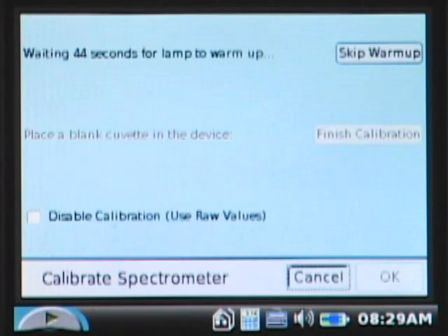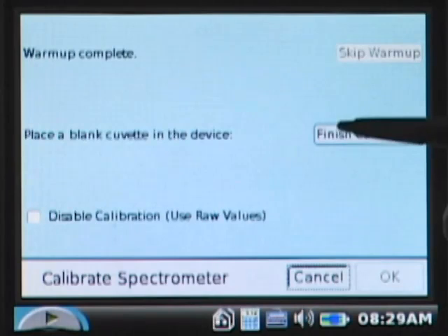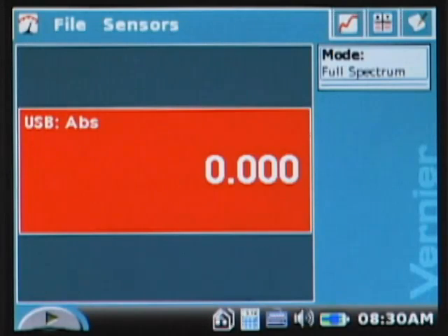The lights turn back on and the screen indicates it's waiting 60 seconds — we're now down to about 30 seconds — for the spectrometer to warm up. The warm-up is important, so we'll go ahead and wait. Once done, we tap 'Finish Calibration,' tap OK, and the calibration is complete.